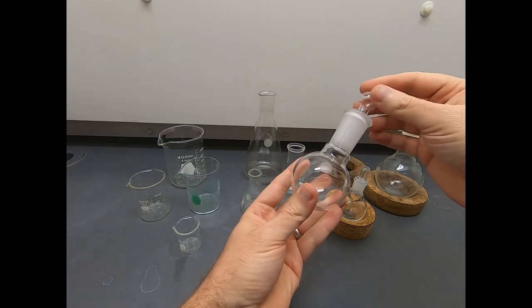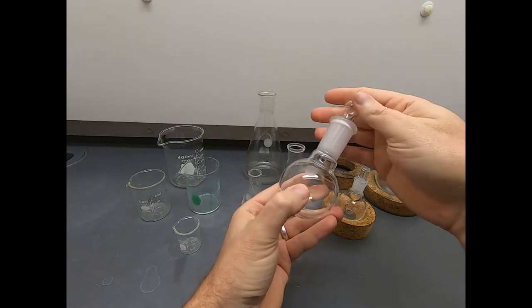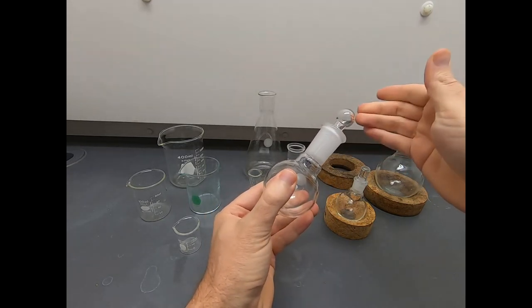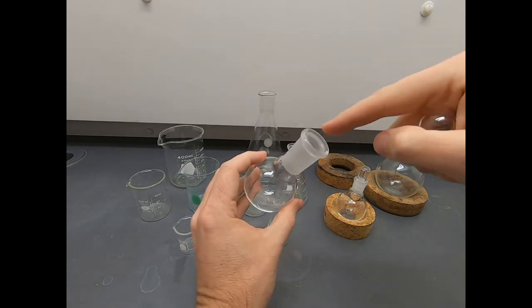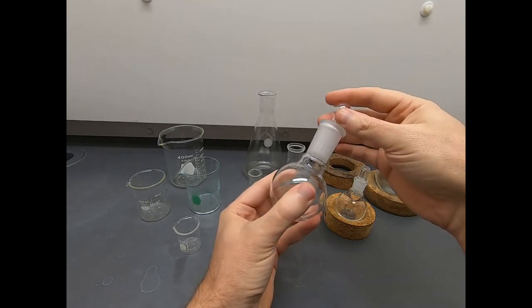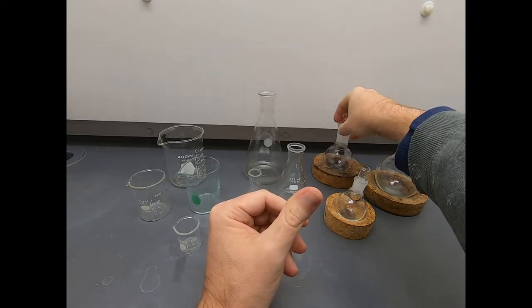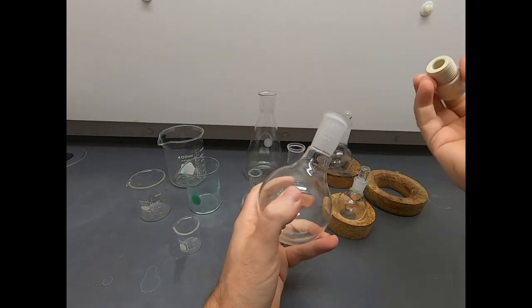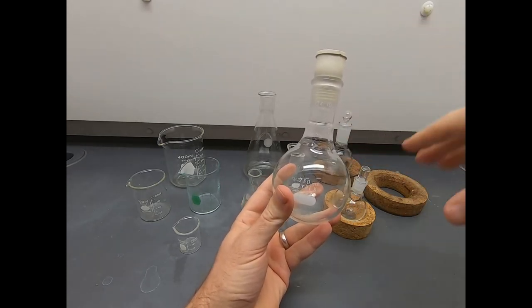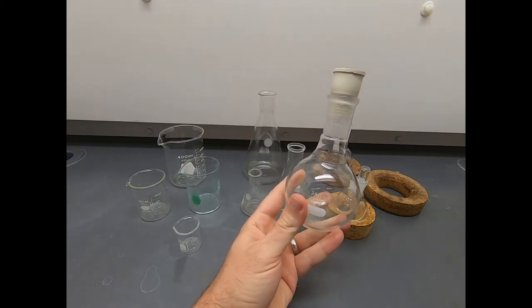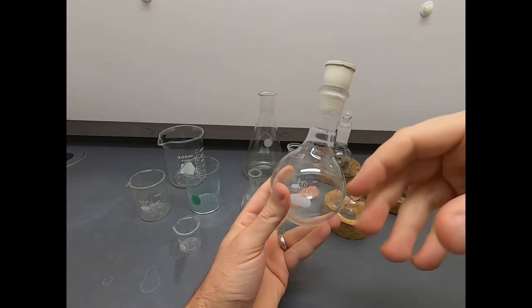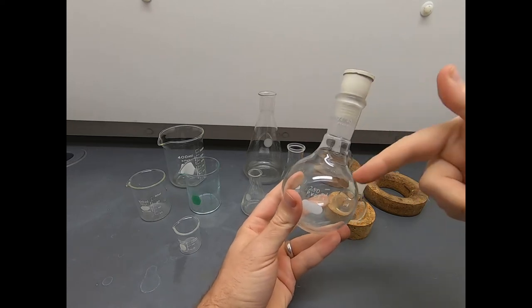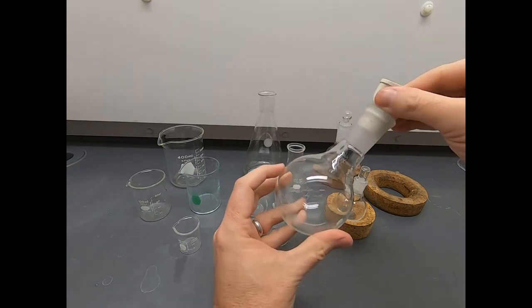These stoppers provide a way to seal things up. The ground glass, if you put other connections on the ground glass, it's easy for this ground glass to fuse together. It doesn't chemically fuse together, but if you get dirt in between, it makes the ground glass get stuck. Therefore, people are typically fairly particular about keeping these ground glass surfaces as clean as possible so that you don't stick things together, because they can be a real bear to get apart.